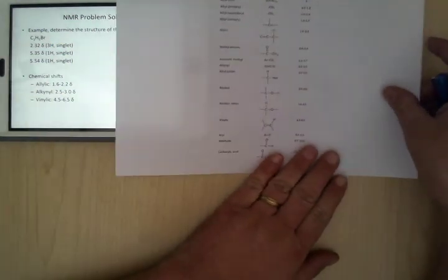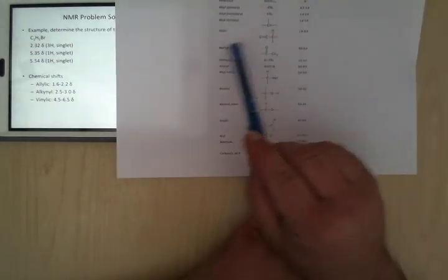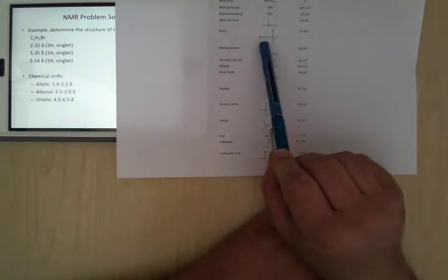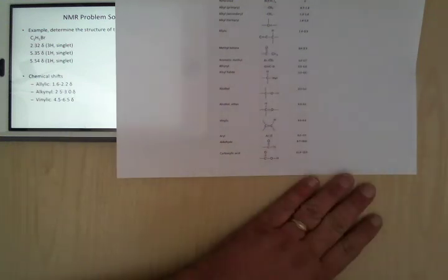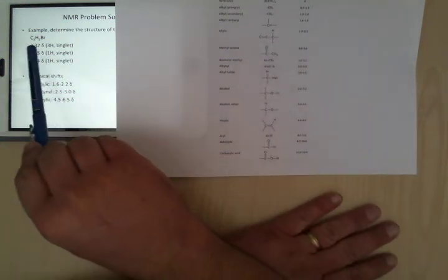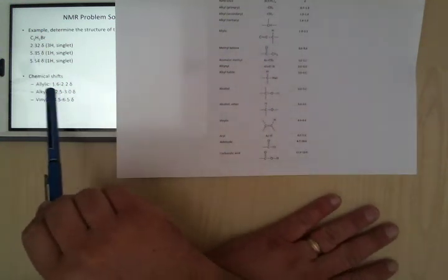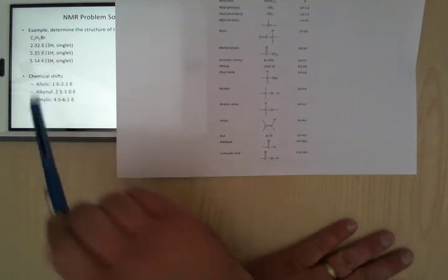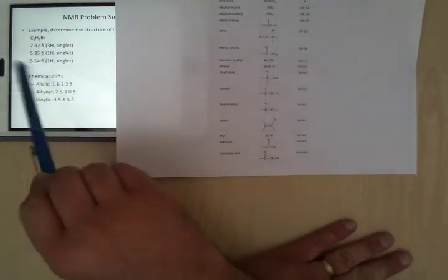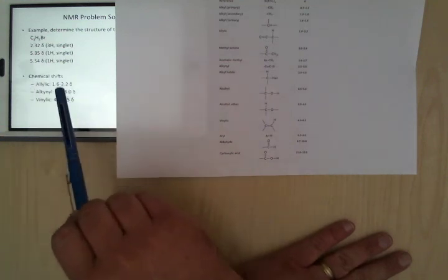Right, so you look here and you say, okay, where does this tell you? Okay, so vinylic or allylic, so it's 1 away, right? So 1.6 to... right, so for this, it's darn close to that. Okay, so if it's a 1/10 away, 2/10 away, there's a good chance it could be there, right? So like that. So we have to keep that in mind.